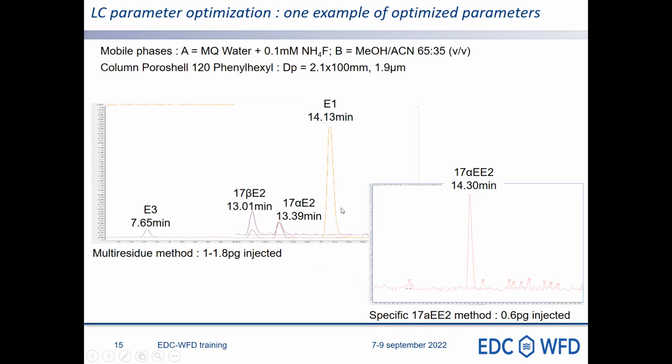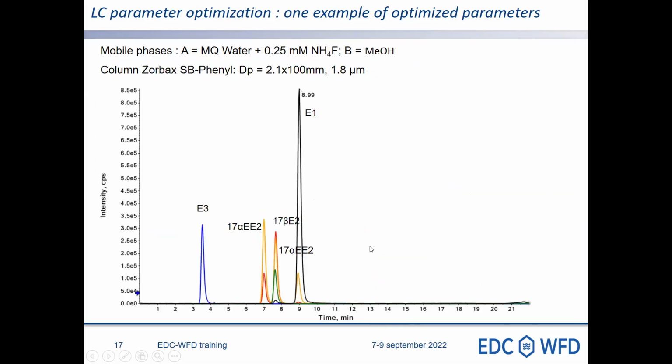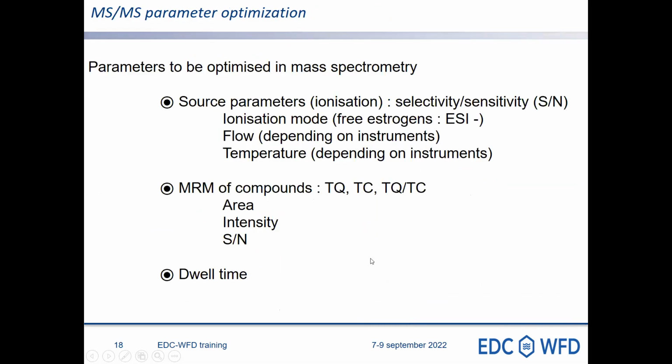And you see there a picture of the chromatogram showing that we have successful separation in all these different conditions of all the different isomers. And when the separation is not perfect, we are specific thanks to the mass spec. So everything is there to show you that you have successful separation.